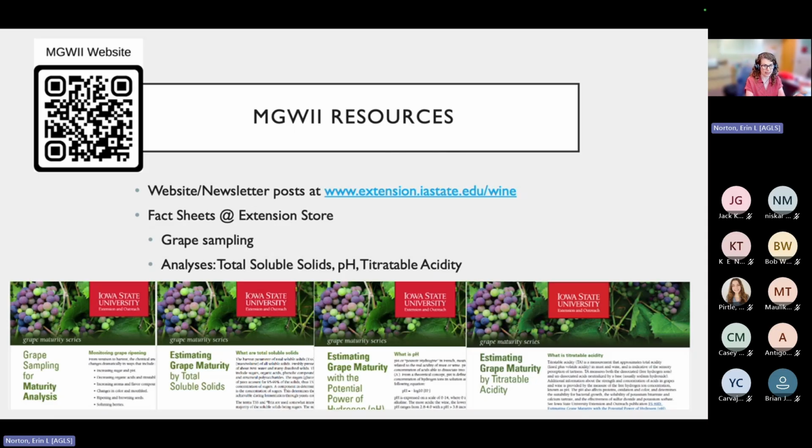First off, I want to start by saying our website has quite a few resources. There are various newsletter articles that we've written over 10 years plus, and there are quite a few fact sheets at the ISU Extension store. Here's a series that colleagues of mine wrote several years ago on grape sampling for maturity analysis. There's one for how you should be sampling your grapes to take a representative sample of the entire vineyard, how to measure for total soluble solids or degree Brix, how to measure for pH, and how to measure for titratable acidity. Those are just for grape sampling.